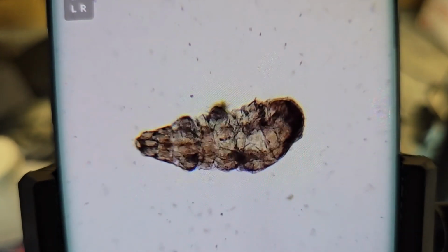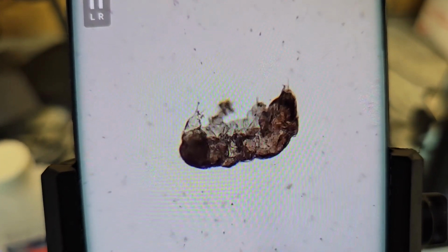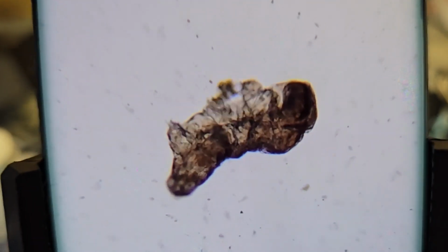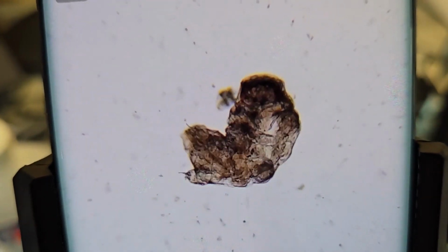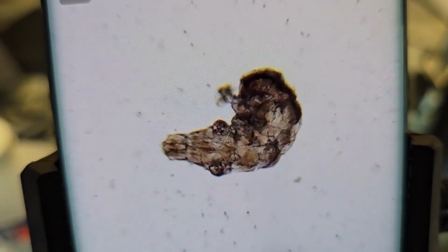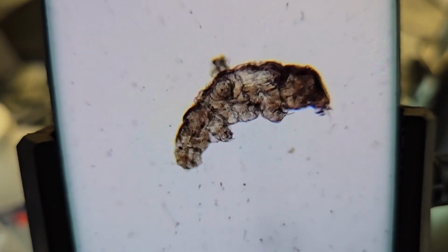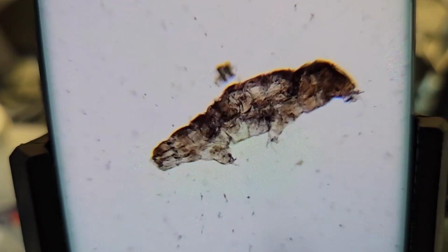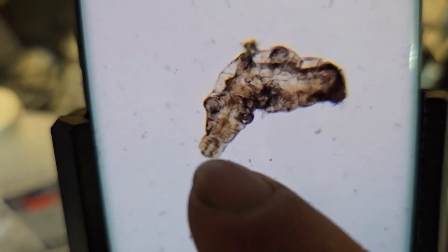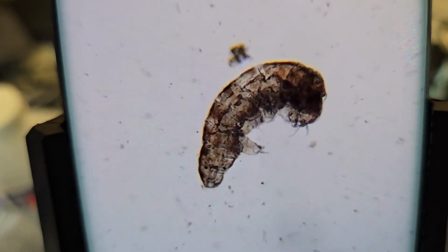You can see his little claws on his feet. Tardigrades are so cool, man. Everybody knows they can survive pretty much anything. They can go into that whole cryptobiosis thing where they're basically indestructible. They can survive low temperatures, high temperatures, nearly no water, radiation. It's insane. Oh, you can even see his little eyes right there at the top of his head. Little eyeballs poking through. He's actually upside down. He's so cute.